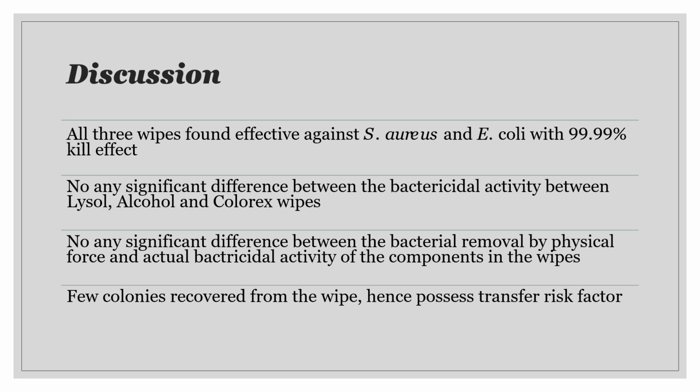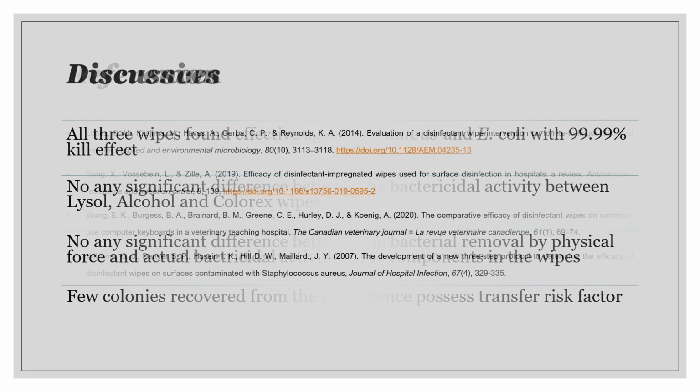Furthermore, a few colonies were recovered from the wipe, hence the wipe poses a transfer risk factor. So if the same wipe is used between the contaminated and the clean surface, there might be chances of transfer of the bacteria from the contaminated surface to the clean surfaces.